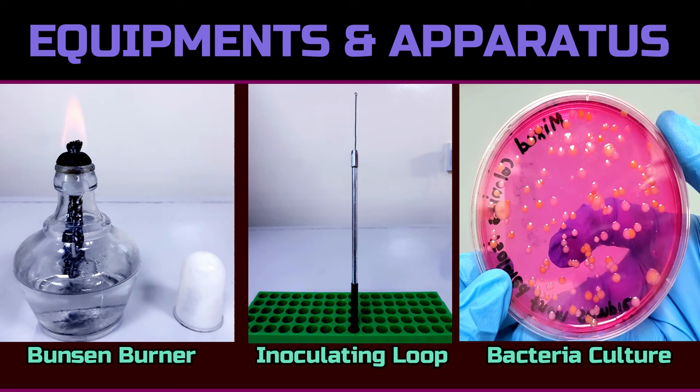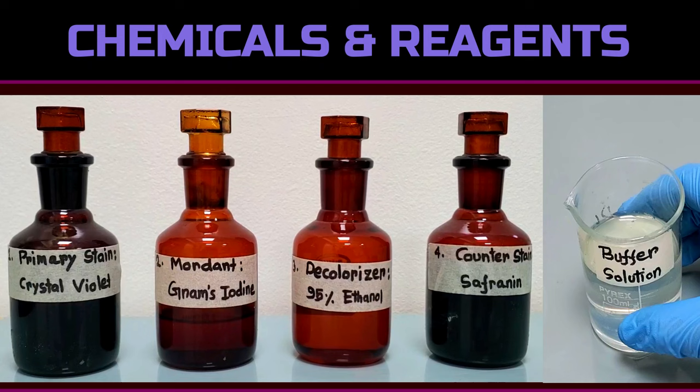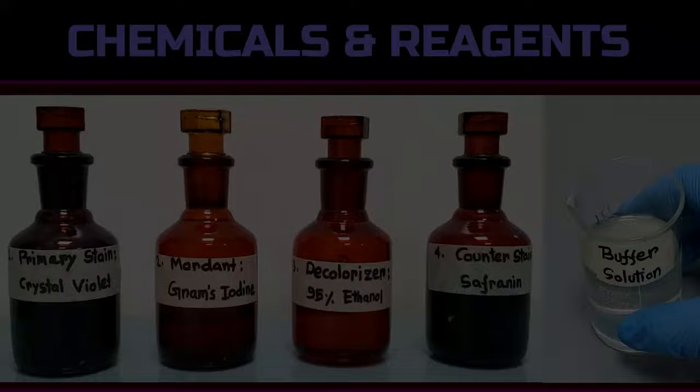Among the chemicals we need: crystal violet solution, Gram's iodine solution, 95% ethanol, safranine solution, and sodium chloride buffer solution. Let's go for the laboratory works.